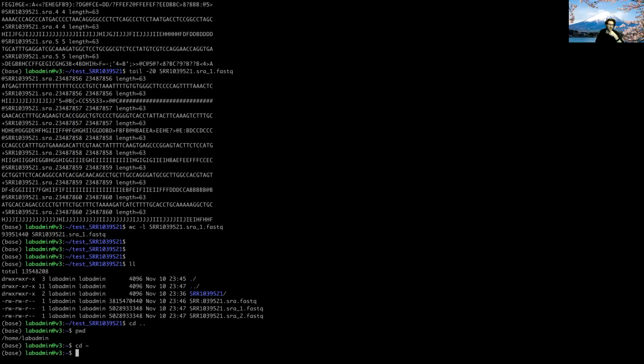This is honestly a bit of a guess for me, because usually I don't do anything with that file. But when you split your data into your mate pairs, so your _1 and your _2, there are often some reads that don't have a mate, and those will go into a separate file. They're called singletons, or single reads. I'm pretty sure the default for fastq-dump is to write those into a separate file. I'm not sure why it's so large for this one though.